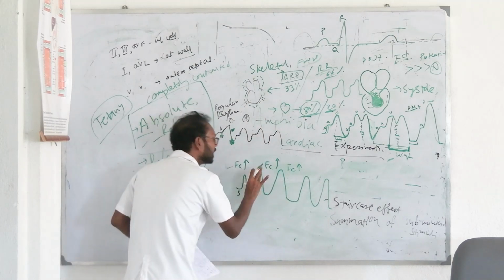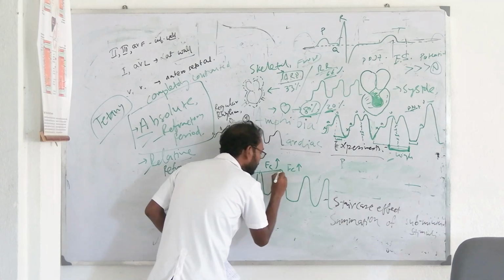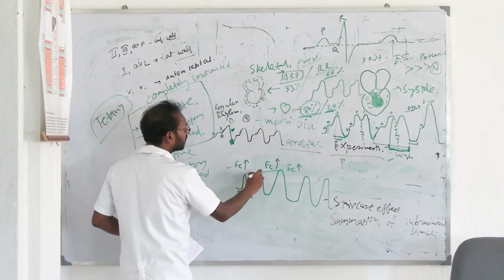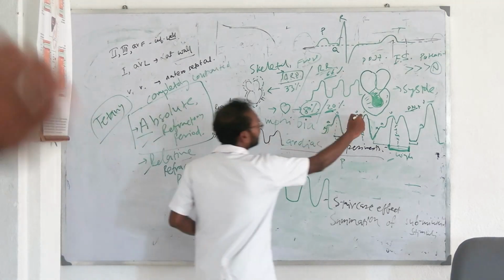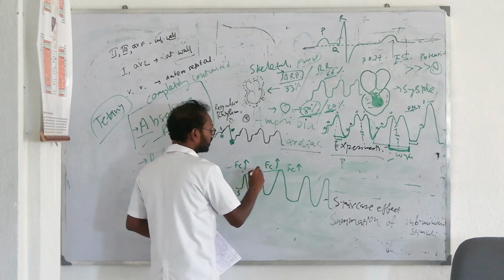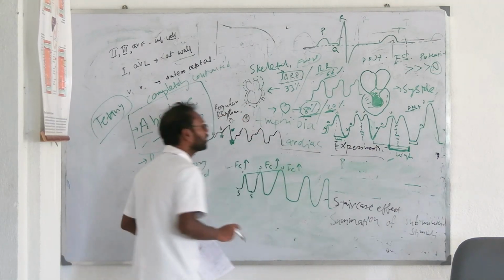দেখো এই যে এখানে, look, this is a staircase. Slowly but surely, when we increase the force of contraction, gradually this graph will increase. First, this is the first ventricular contraction, this is the second ventricular contraction, this is the third ventricular contraction.